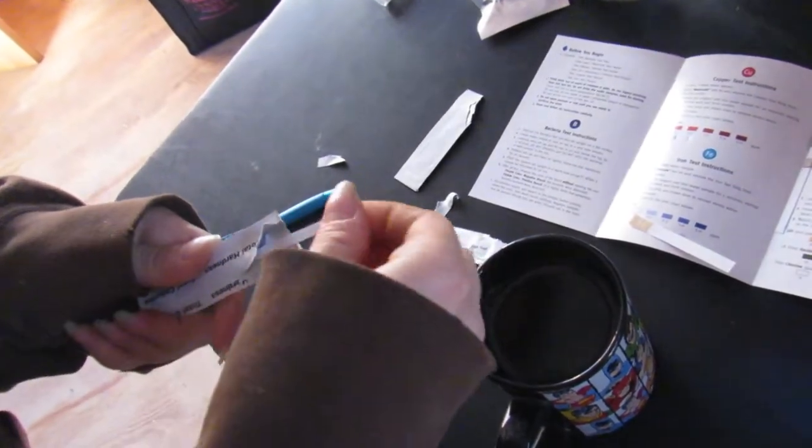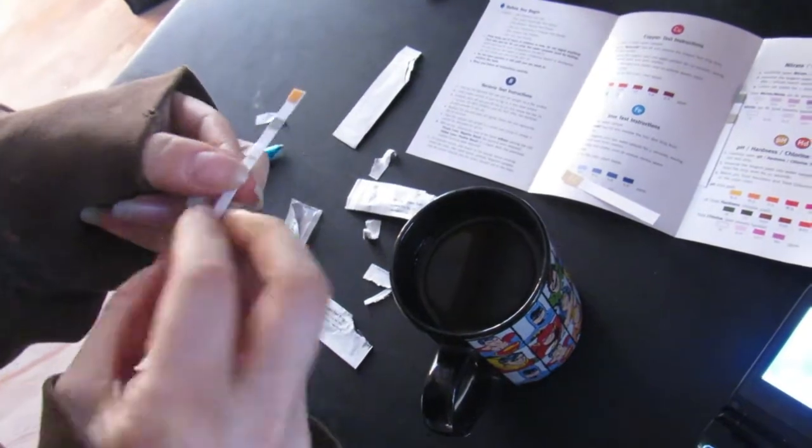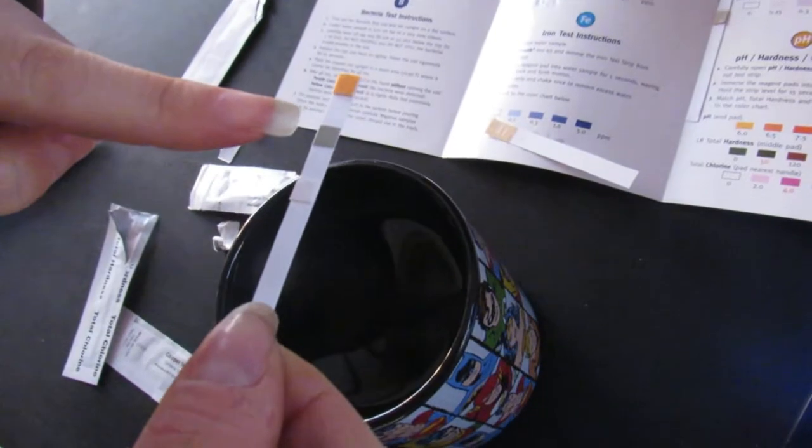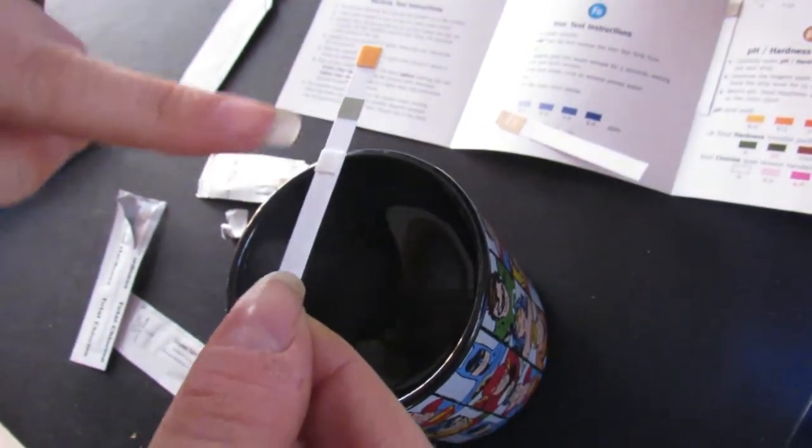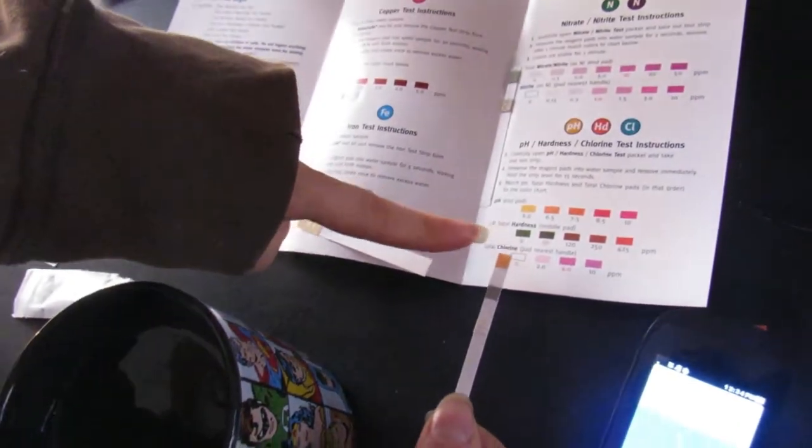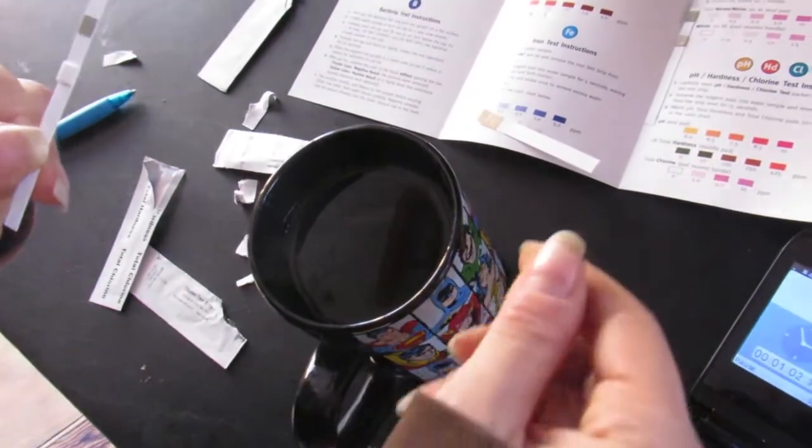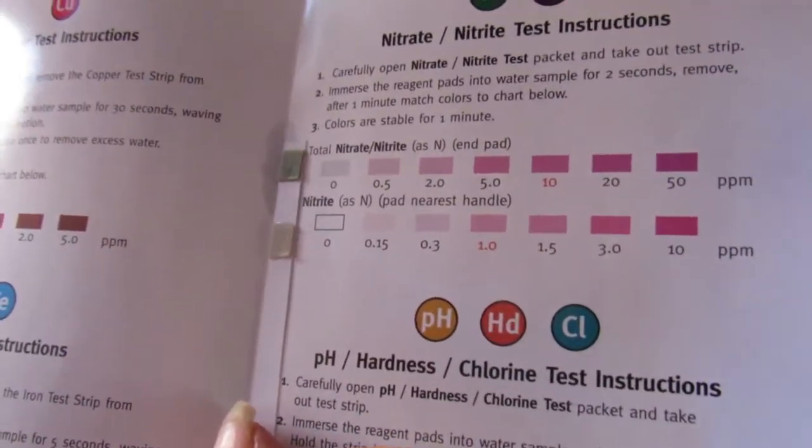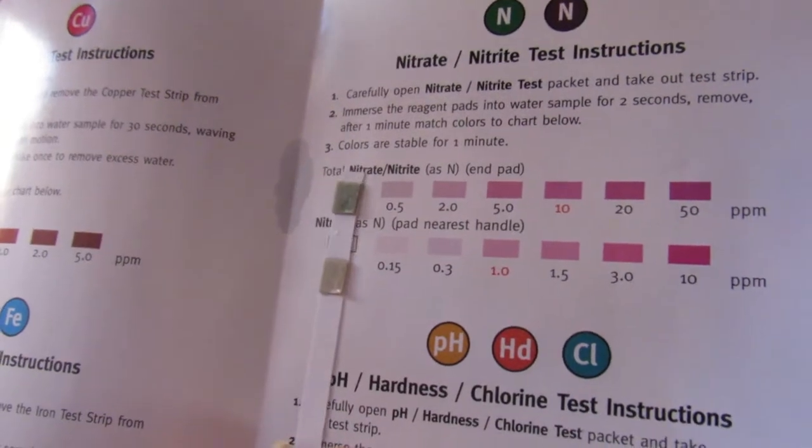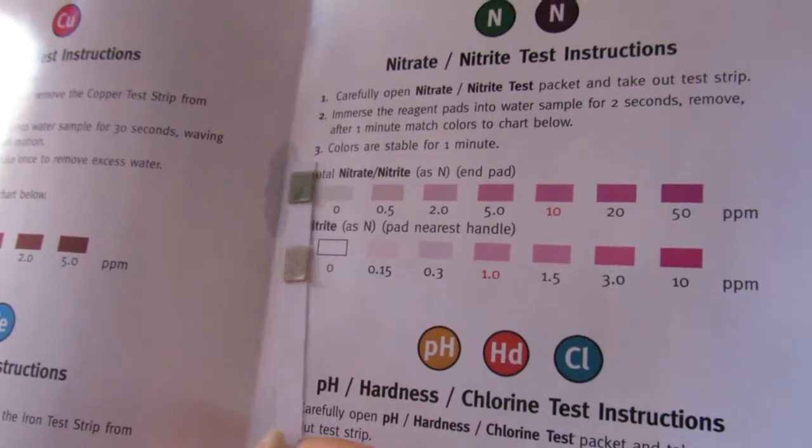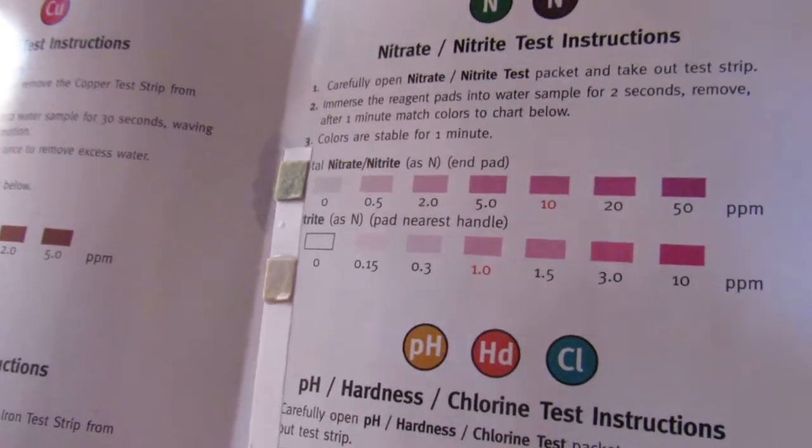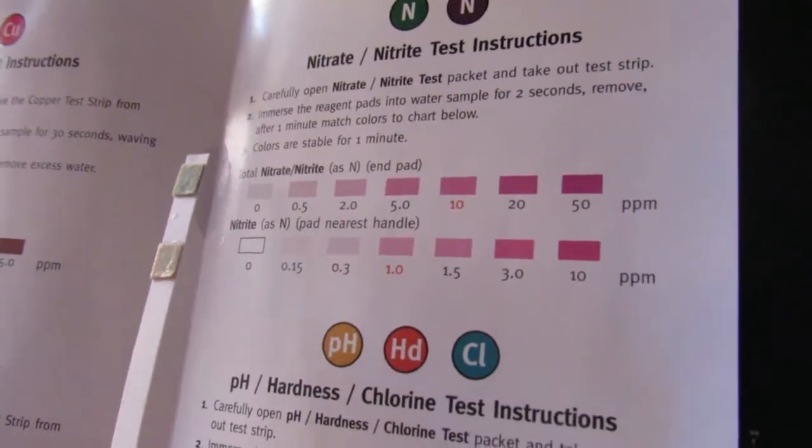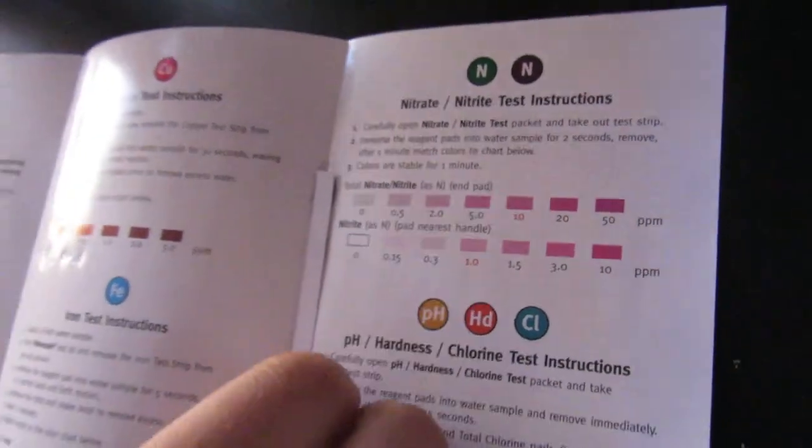Then we have a pH hardness chlorine test on here. We got three on here: pH, then the total hardness, and then the chlorine. All right, the one minute's up for the nitrates. Let's check that. And I'm not seeing any pink colors. What do you think on that one? It's a weird green. Looks good.